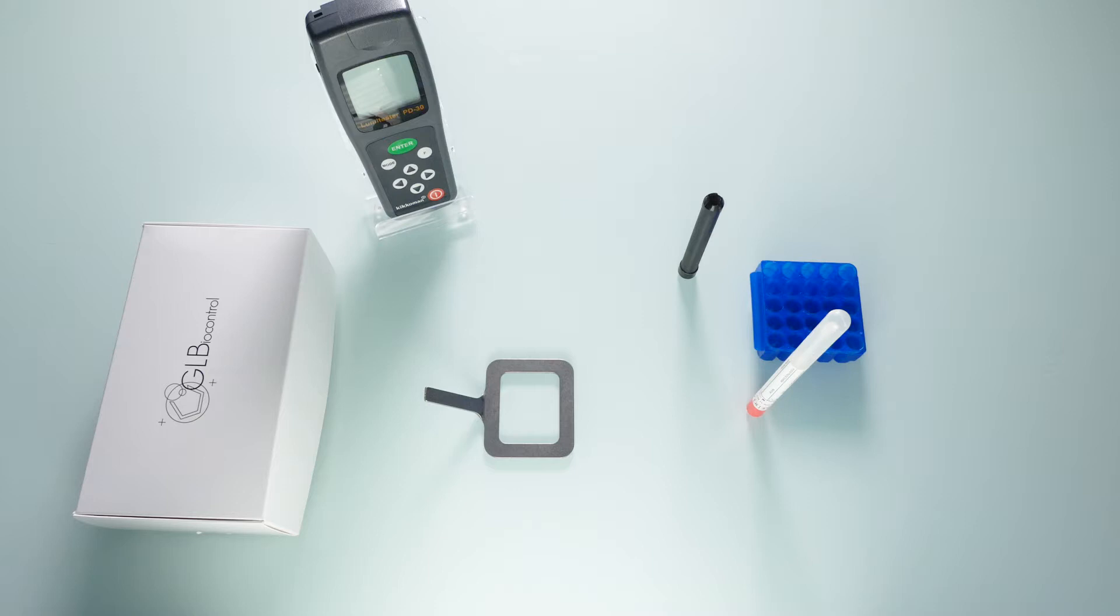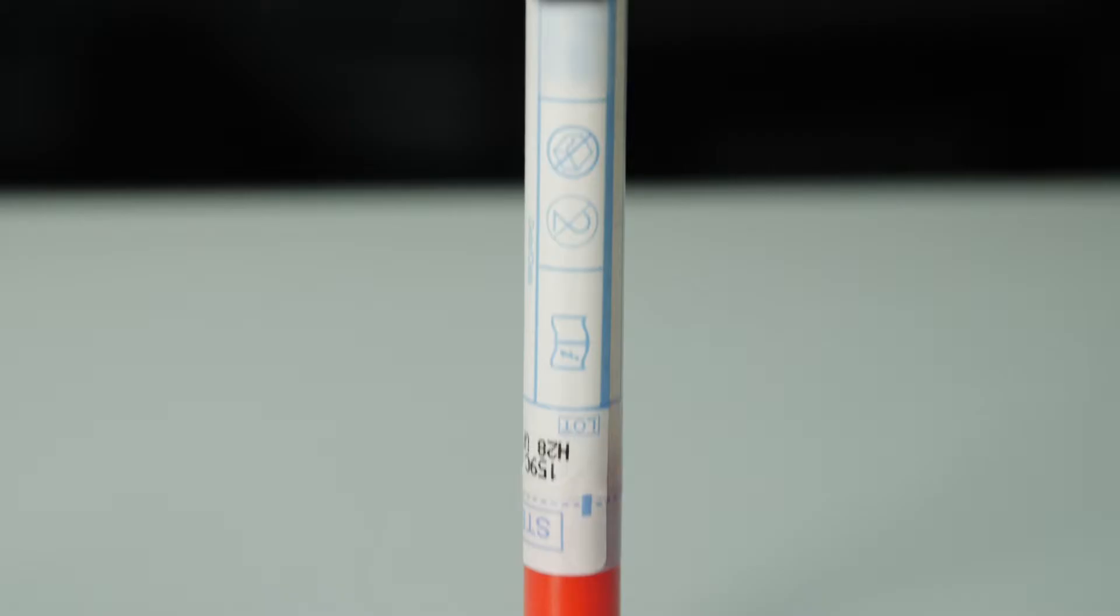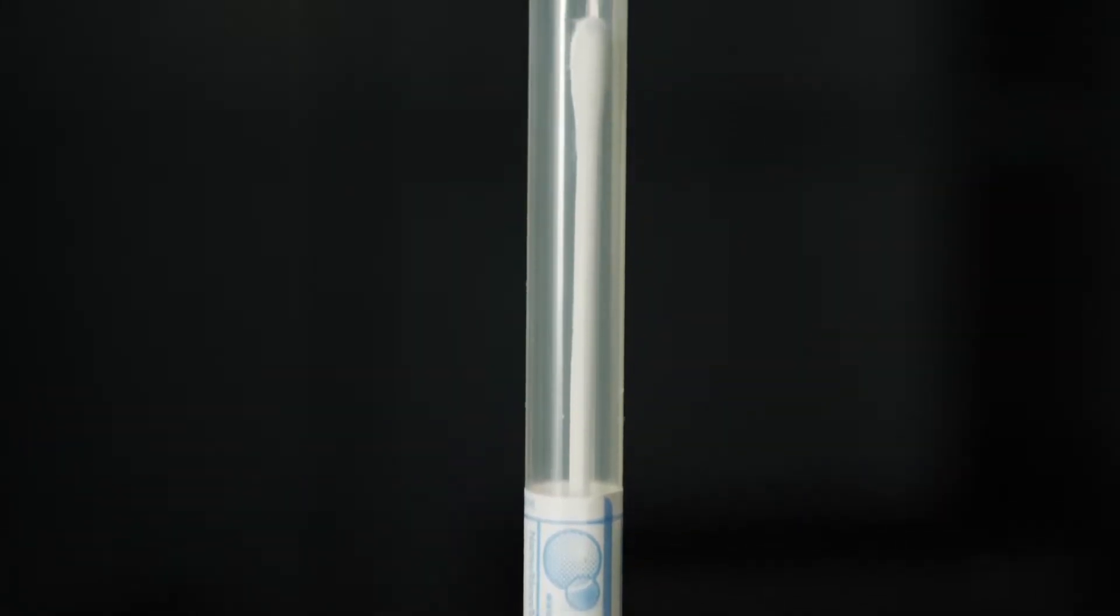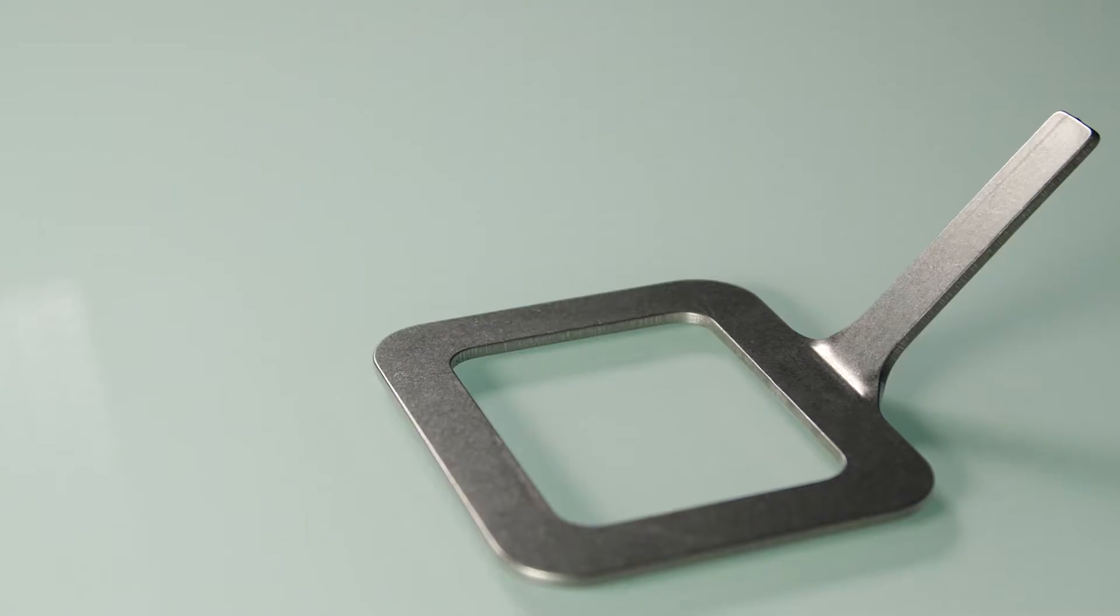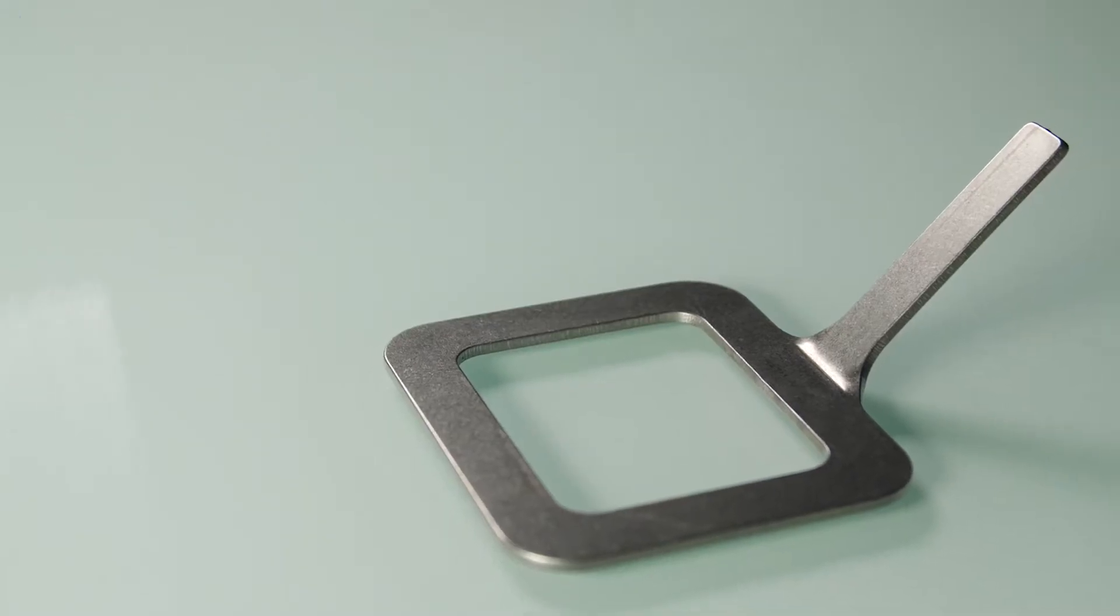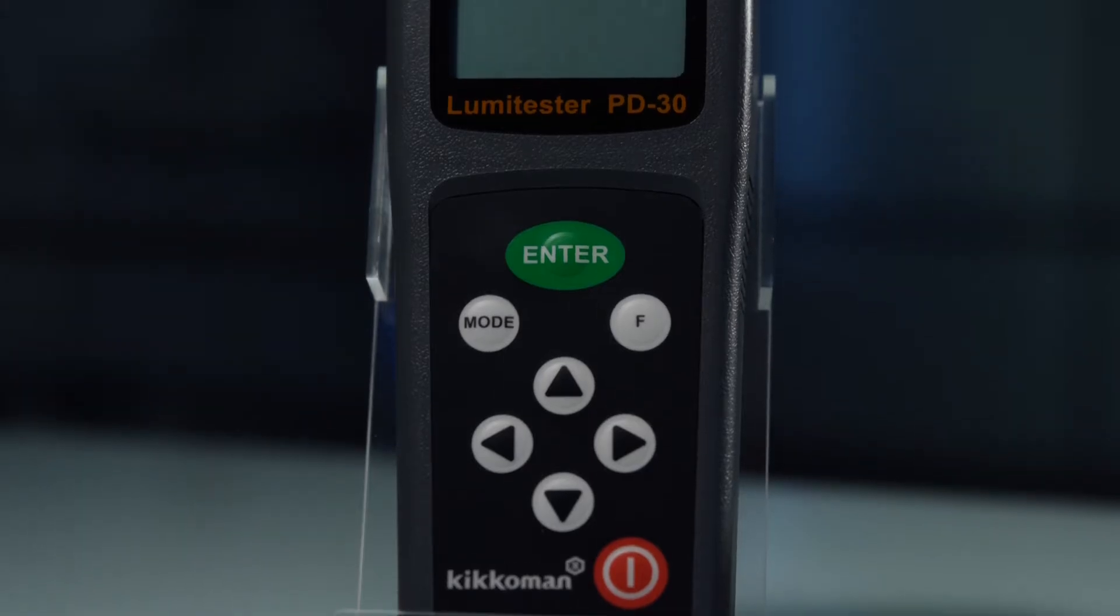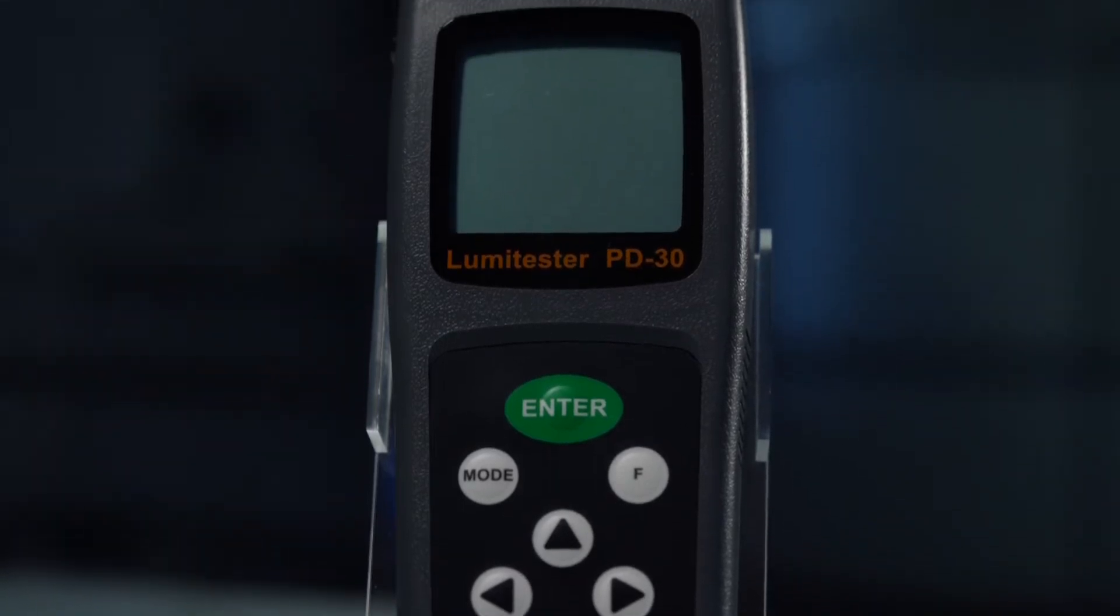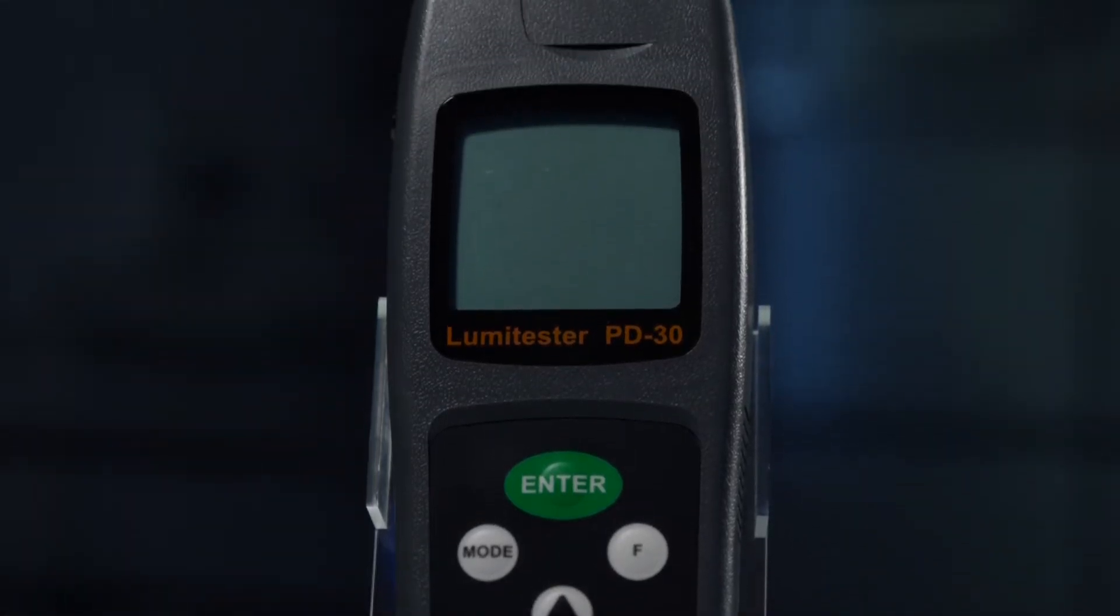To carry out the measurement, you first need to set up the sampling swab, the sampling template, and the measurement device also called a luminometer or ATP meter.